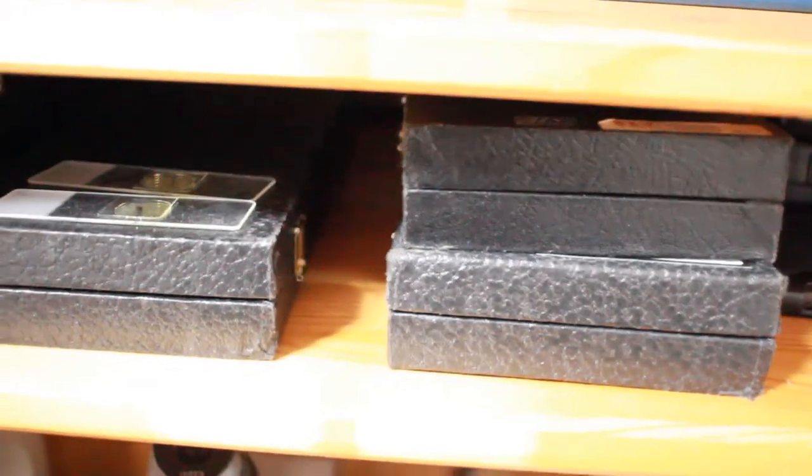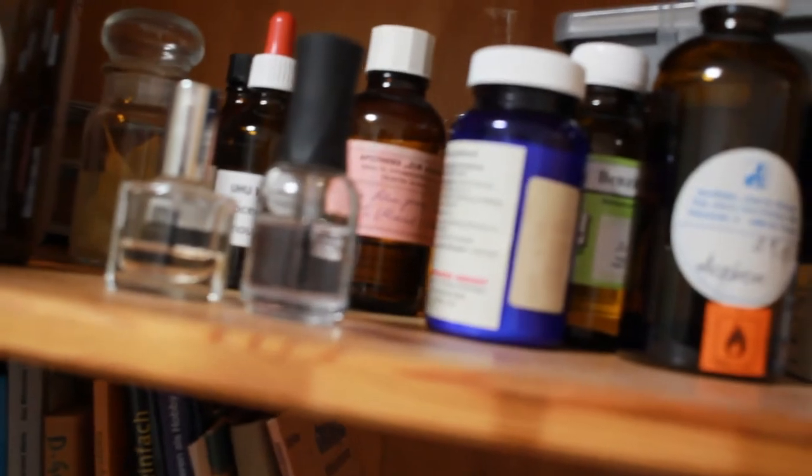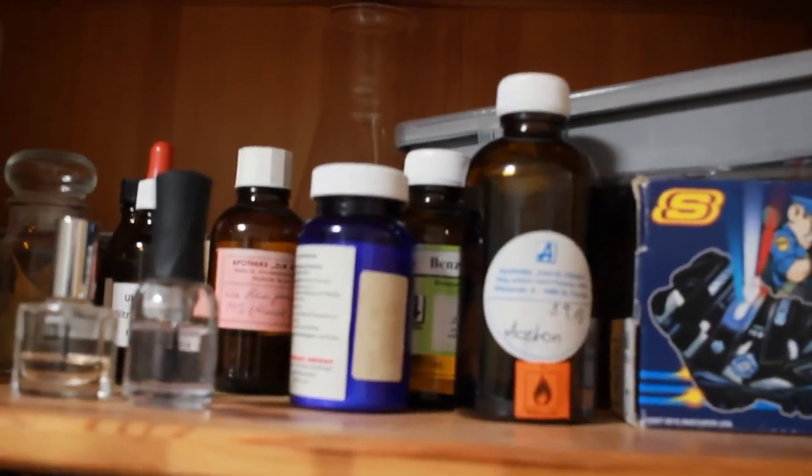I need to refocus again. These are the slide boxes where I have my permanent mounts stored. I have a small book collection here. Some alcohol. In here, I've got slides, and more slides. And all the way at the top here, I've got some chemicals and solvents, and I store them up here so that they cannot be reached very easily. So that's basically it, really. That's all my microscopy stuff here.